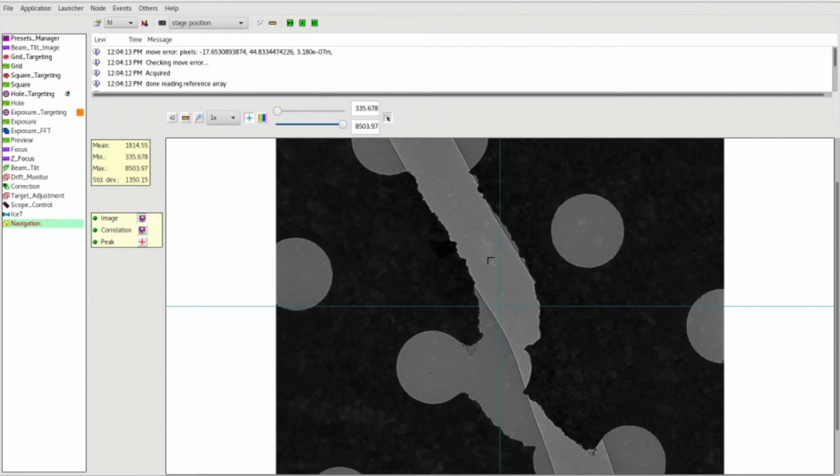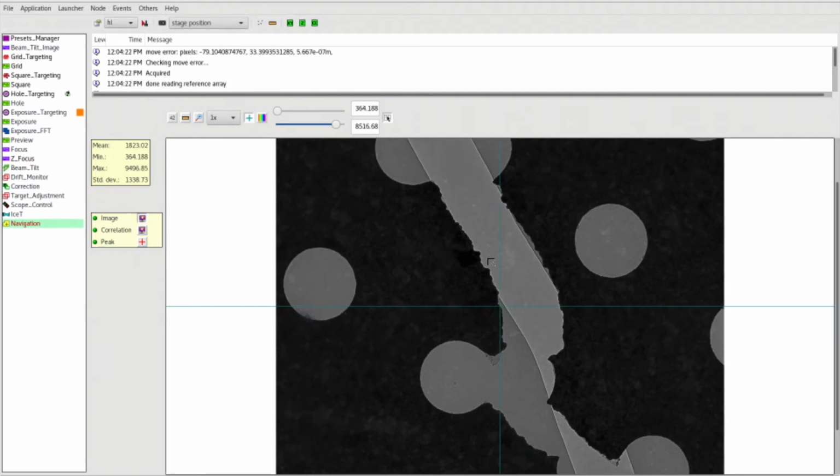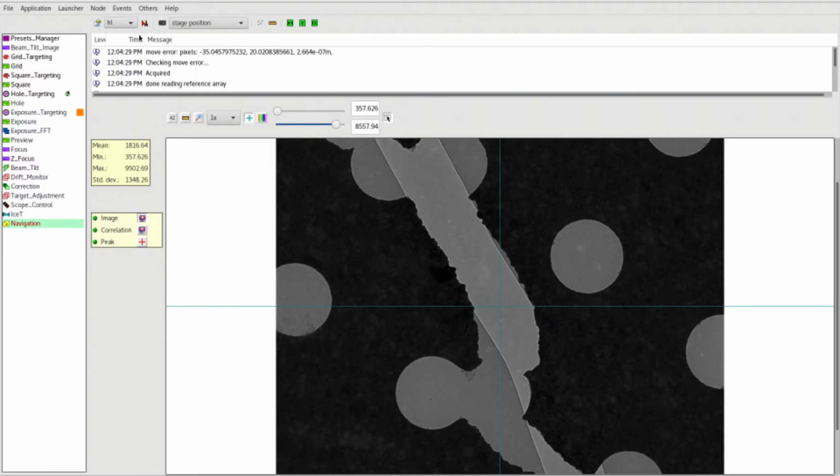You can adjust your movements. Now select EN and send to Scope. Acquire image.